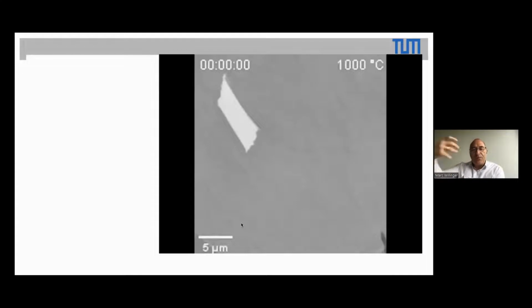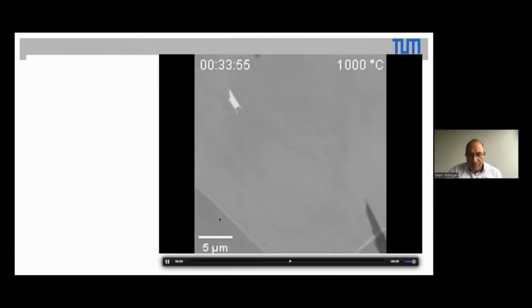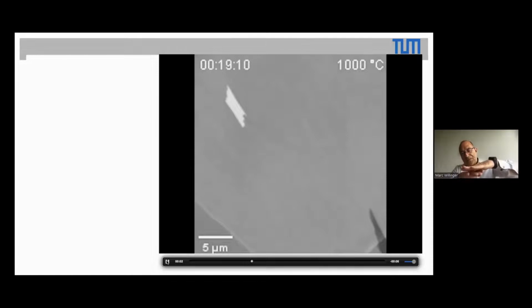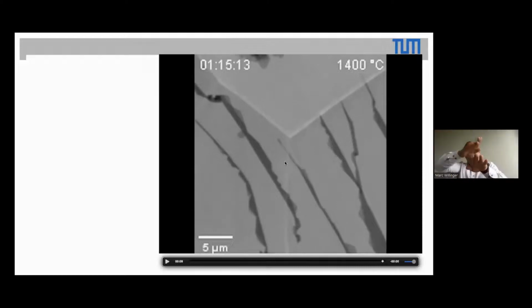And what we do then is we recrystallize the grain such that it gets flat. And this is what happens in this video. So we heat further and we recrystallize that grain. So there's another grain orientation propagating into that grain. So basically, it's a surface reconstruction. This grain of platinum that was stepped disappears, and the flat grain moves underneath. Now there was graphene already here, but as the substrate underneath suddenly gets flat, that's happening here, the conformally coated zigzag graphene has too much space, and you form these guys here, which are actually wrinkles.